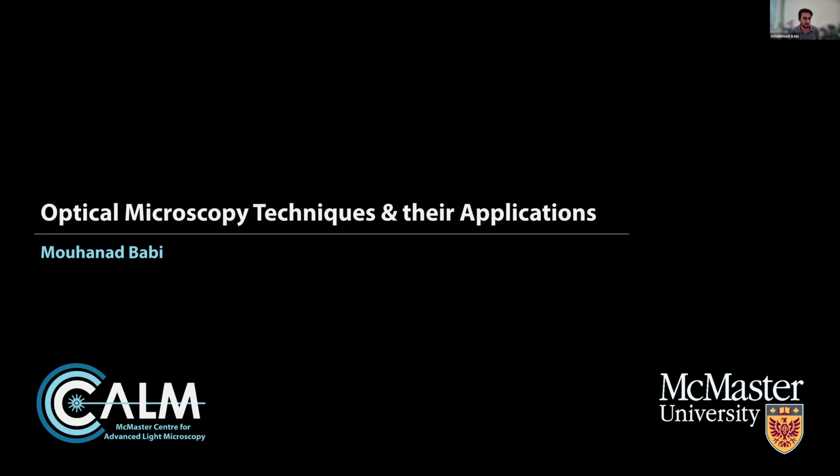Now in the presentation, I'm mainly going to be going over different microscopes that we have in the facility and some of the applications that we've been using them in, but the takeaway message here is that all of these techniques are actually the same in the working principle. And so although the microscopes will actually be different, they're all working in the same sort of fashion.